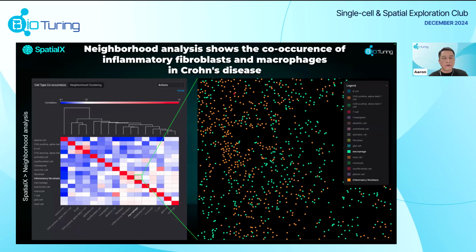Besides doing the cell proportion, I also want to mention that in SpatialX, we are also able to analyze gene expression, differential gene expression, and also pathway analysis. But for the scope of this webinar, I focus more on the cell information, and the gene expression analysis will be coming in the next SCSE Club.